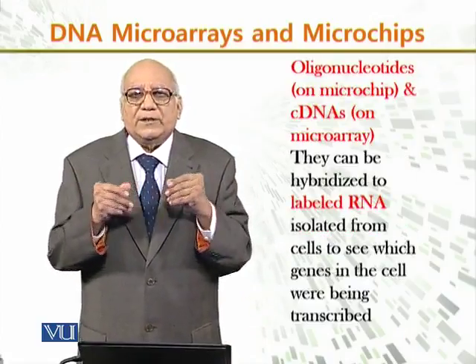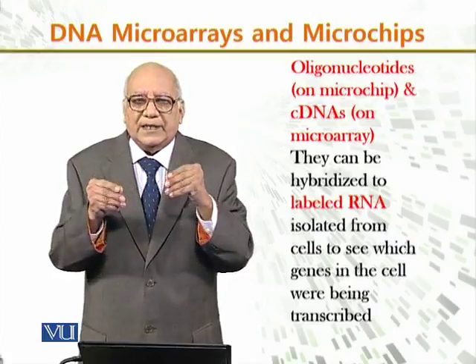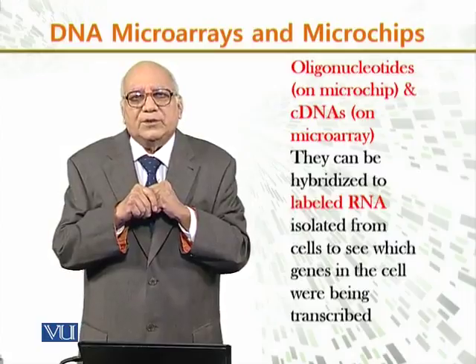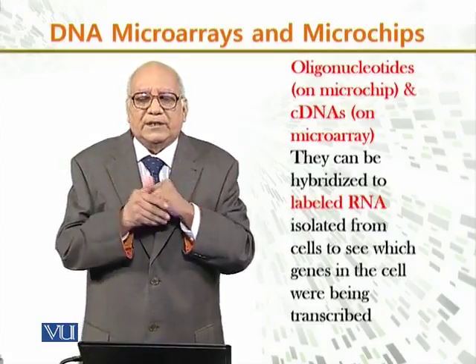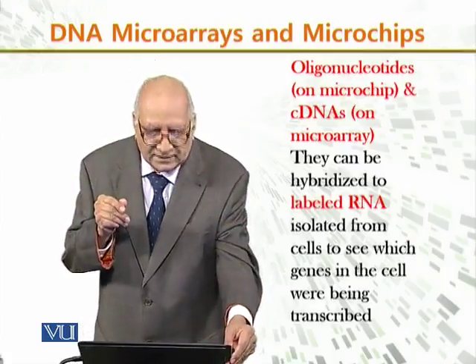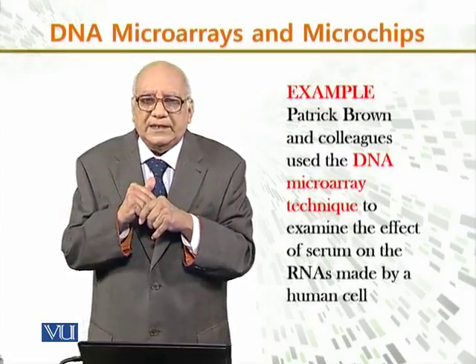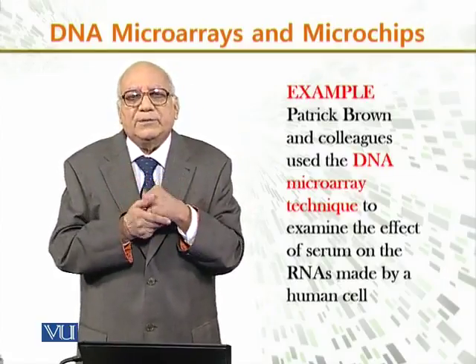Oligonucleotides on microchips and cDNAs on microarrays can be hybridized to labeled RNA isolated from cells to see which genes in the cell were being transcribed. This is very important because in that microarray, you can see a large number of genes in only 1 inch square area and get the result. For example, Patrick Brown and his colleagues used the DNA microarray technique to examine the effect of serum on RNAs made by human cells.